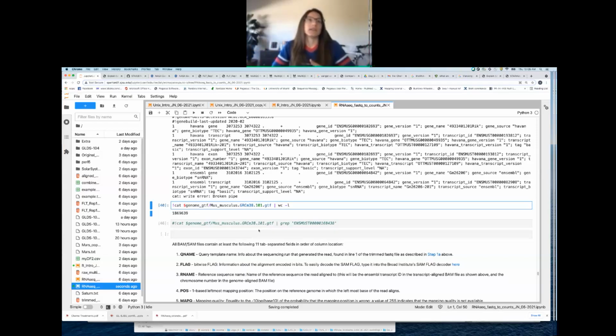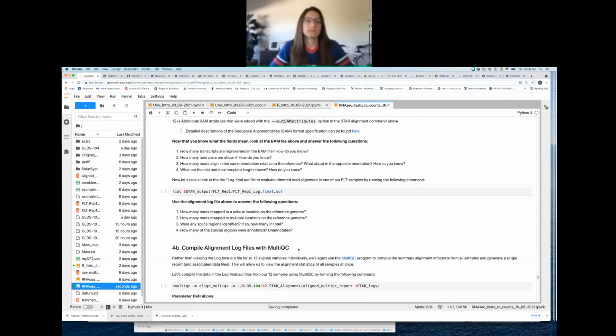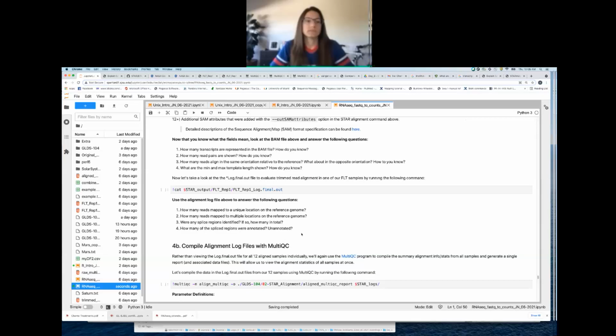And so in the subsequent commands, we again opened up that file, except this time we piped the result of that. So the contents of that file were given to the function grep, and we told grep to search specifically for those transcripts, looking at one at a time. Does that answer your question, Eowyn? Awesome. Okay, good questions, everyone. I'm glad we got to play around a little bit.